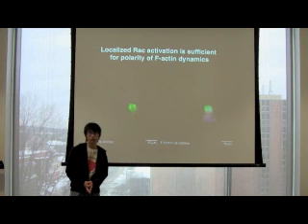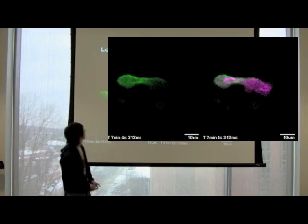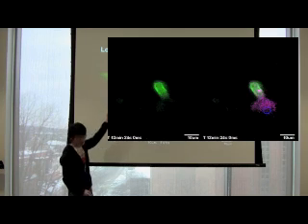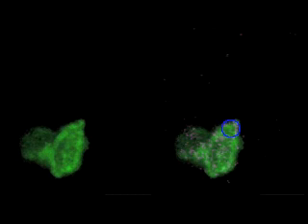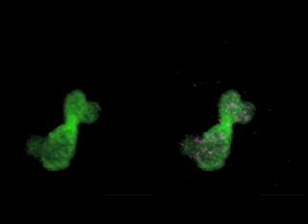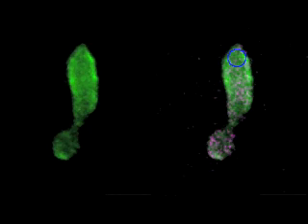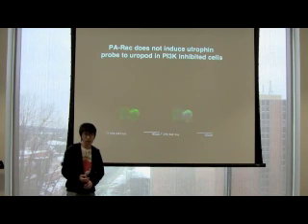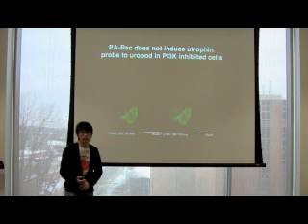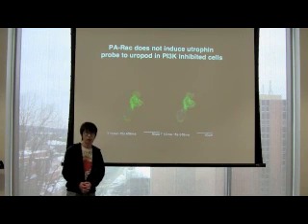We combined PA-RAC with probes for stable F-actin. In the control movie during photo-activation, stable F-actin is localized under the tail. In the next movie, PI3 kinase is inhibited, and under PI3 kinase inhibition, surprisingly, photo-activation of PA-RAC can still induce protrusion. However, the polarity of F-actin dynamics is reversed. This suggests PI3 kinase regulates the polarity of F-actin dynamics in a pathway separable from RAC-mediated protrusion.